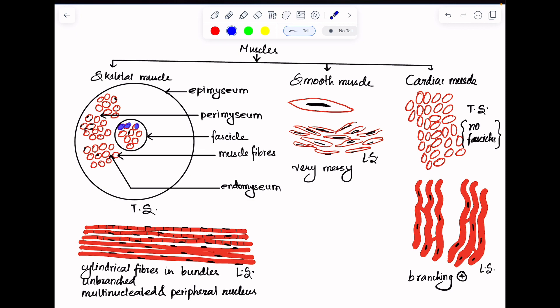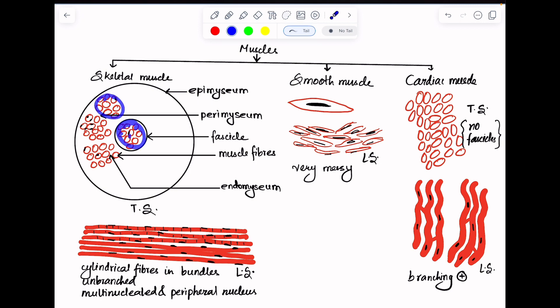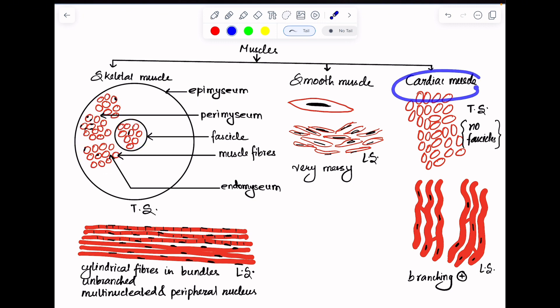This bundle is what we call a fasciculus. There are multiple fasciculi, and in between these fasciculi there is well demarcation due to the presence of fibrous connective tissue called perimysium. So skeletal muscle fibers are arranged in bundles, and these bundles are well separated from one another due to the presence of perimysium.